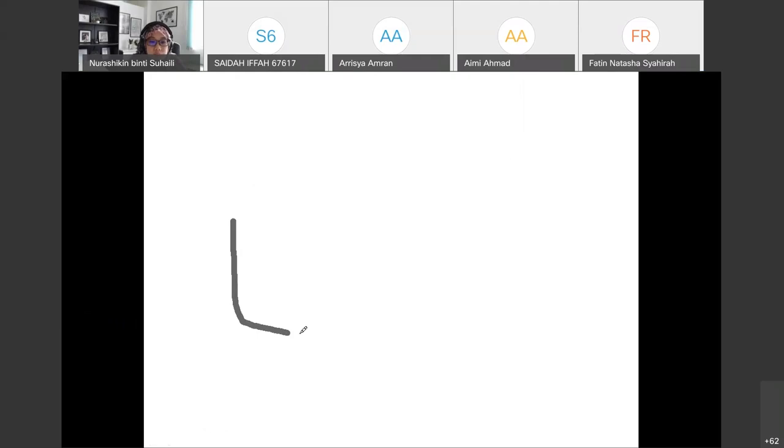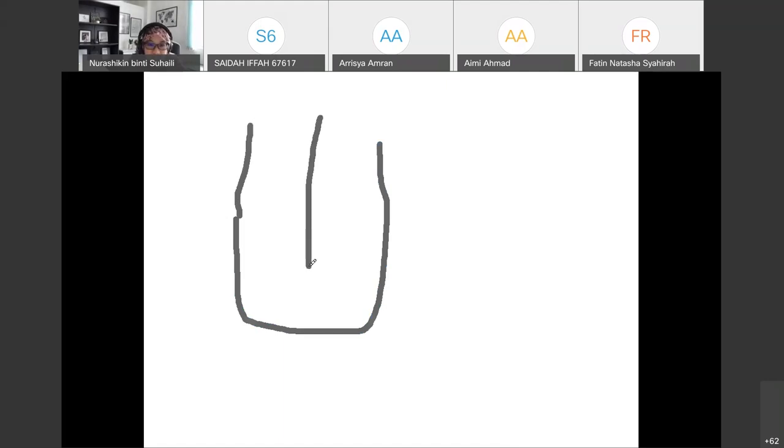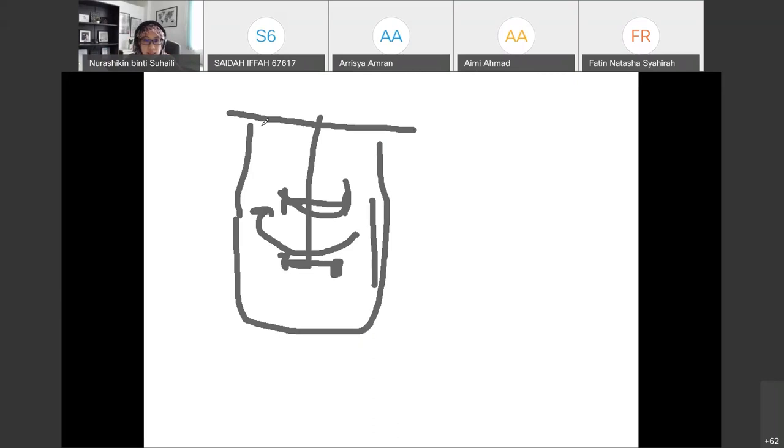Okay. So let's say this is the reactor. Sorry for not having a proper drawing. Let's say this is the impeller, the agitation system. For example there are two impellers. Of course the mixing will happen inside, right? When this is agitated, it will move in a circular motion inside. But at a certain point, the baffle will sit somewhere here. It is attached to the top plate, the lid. The baffle is attached to the lid there.